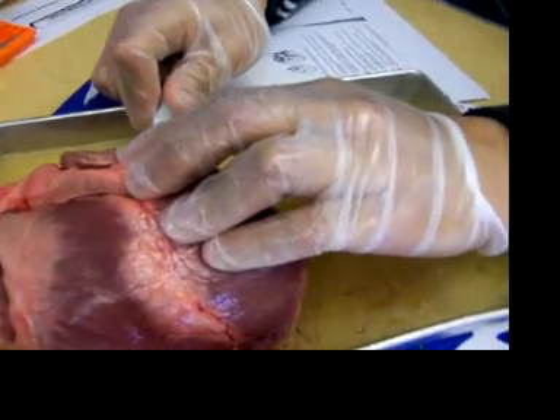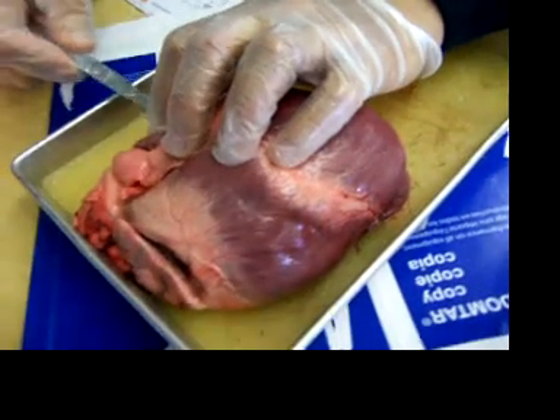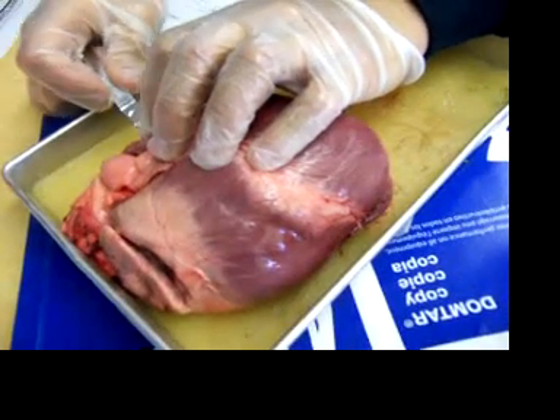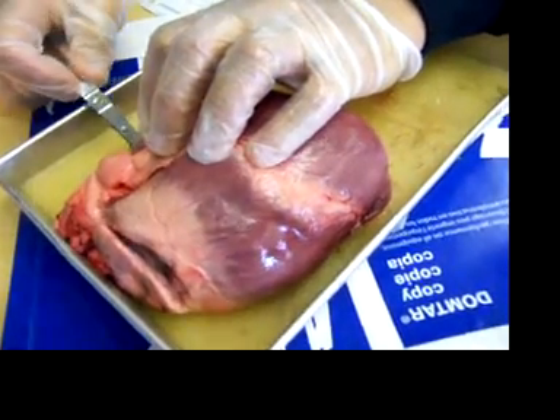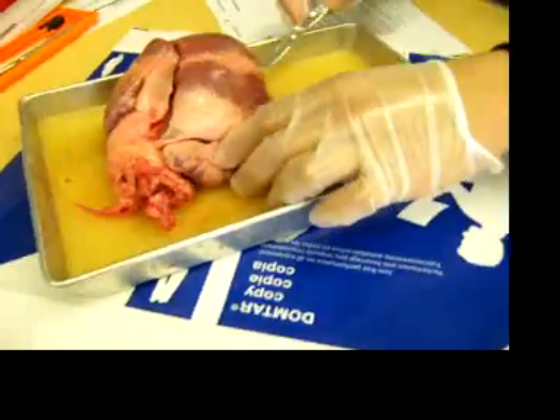I don't know what I'm cutting. Is this good guys? Can you open a window? It's actually hotter outside. It actually is hotter outside. So we cut it like that. The other side cut.